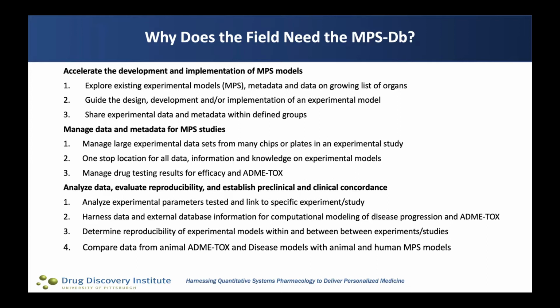Having the metadata is really important, and we've put a lot of effort into making sure that in addition to capturing the data output from the studies, we capture the study configuration data that's important in terms of the interpretation of the results.